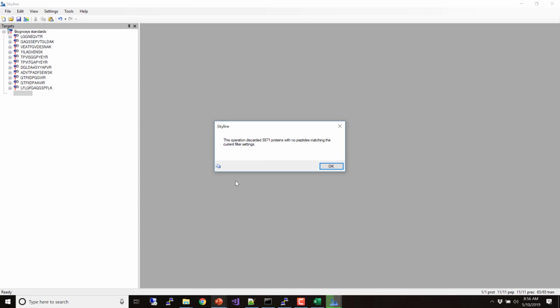Okay, so what is Skyline telling me here? How is anybody else at this point? There must be some people who are already past this point, right? No? How far are you? What percentage? 20%. Oh wow! You gotta get a faster computer.